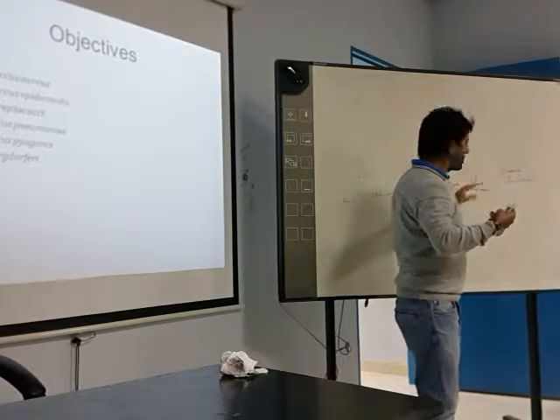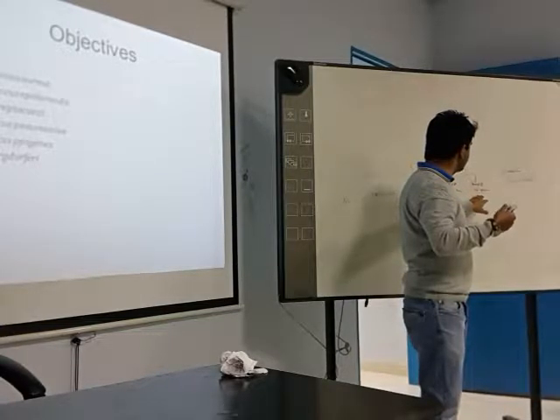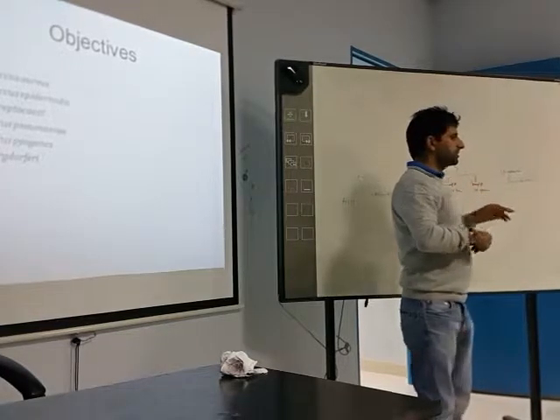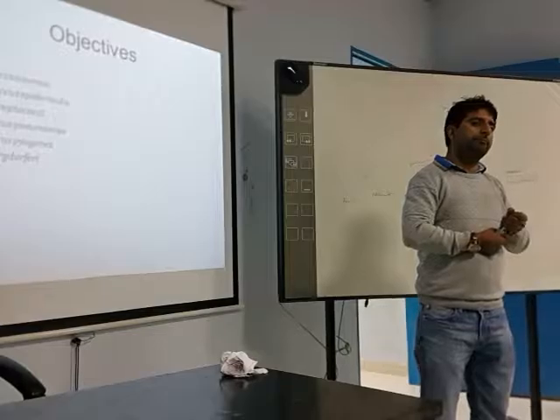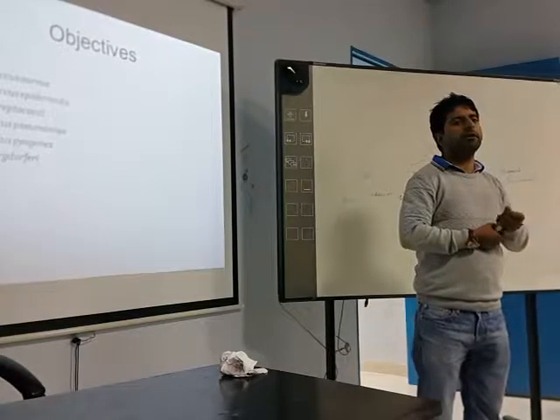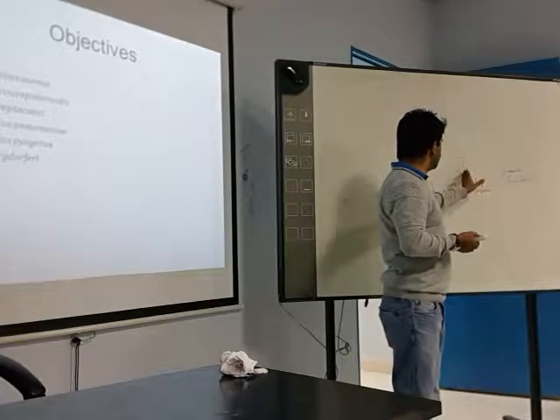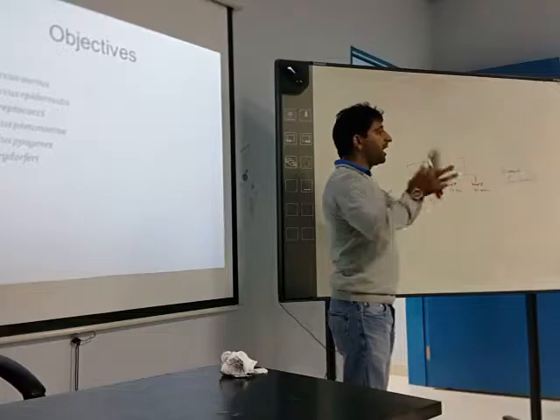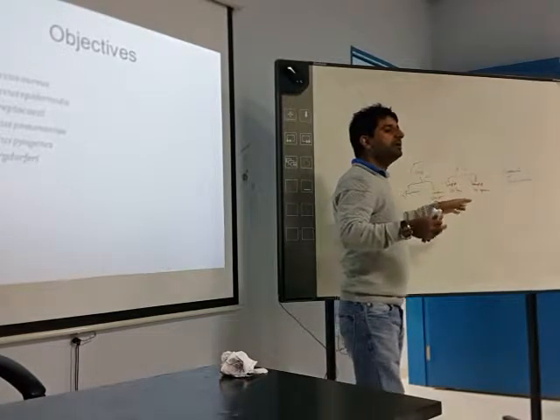How we can differentiate a hemolytic bacteria like group A Streptococci pyogenes from group B Streptococci agalactiae. For example, these are the examples. And in the group B Streptococci, some bacteria are weakly hemolytic. So we will see how we can differentiate group A, group B. We will see how we can differentiate alpha hemolytic bacteria, Streptococci pneumoniae, and the viridans.